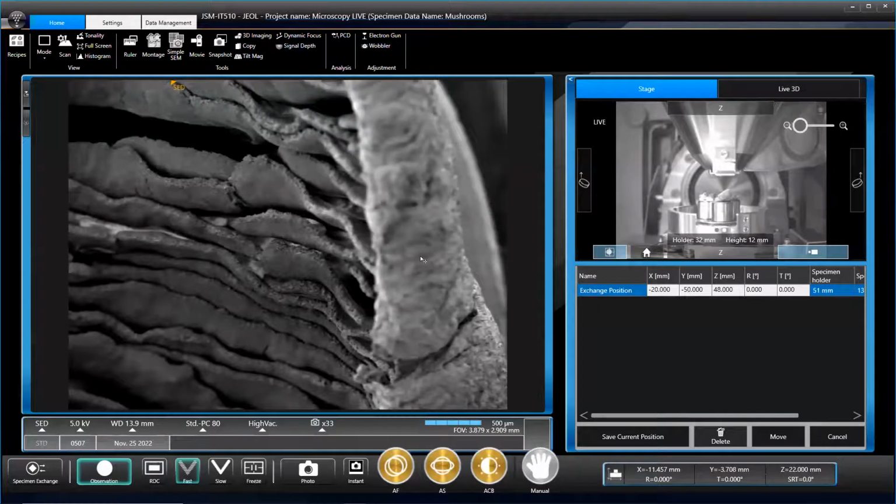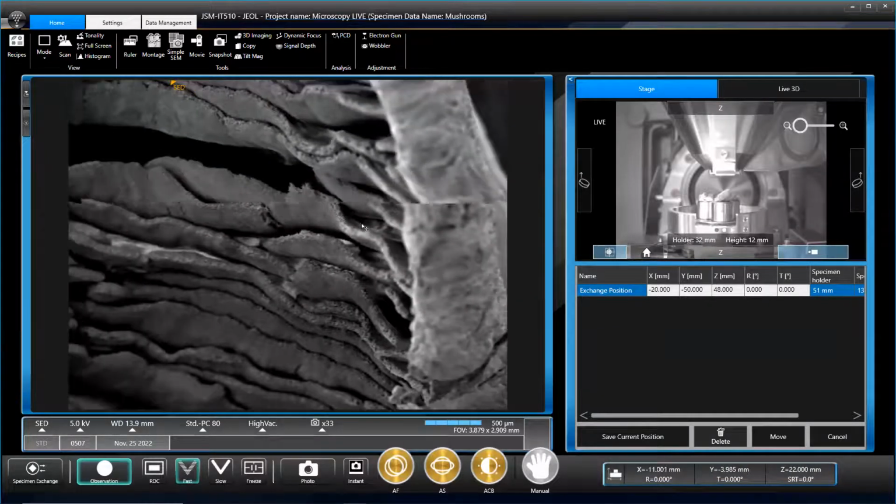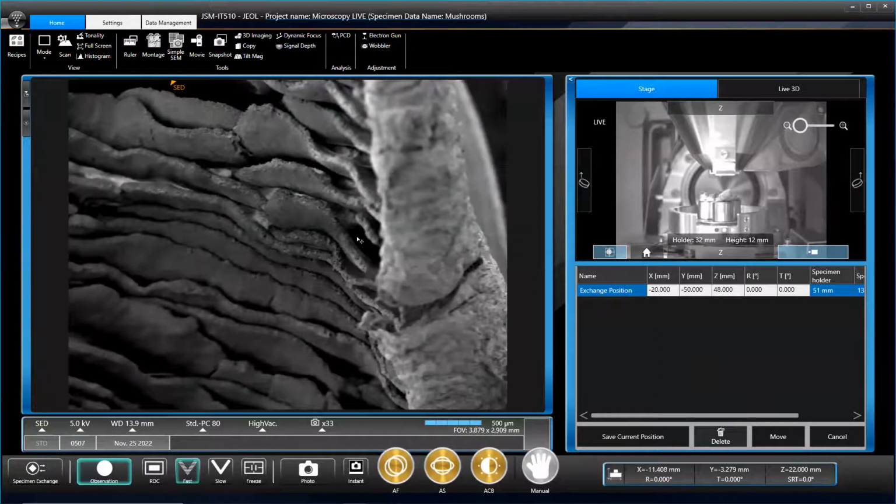That edge on the side, that's the top of the cap surface rolled over. Is it attached to this? I think so, yeah. It should be like the outer edge. I'm just trying to see if we could find a protected bit to see if we've got any spores.